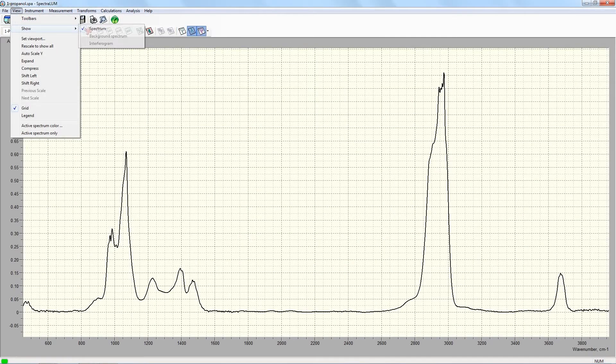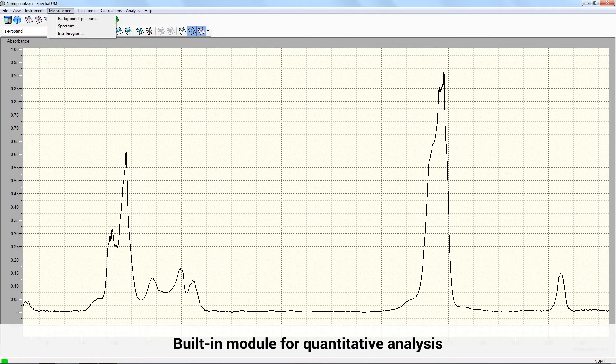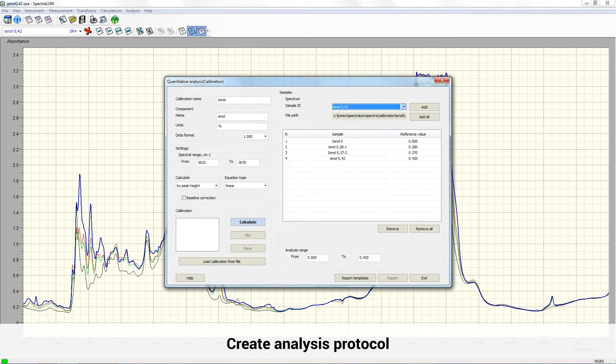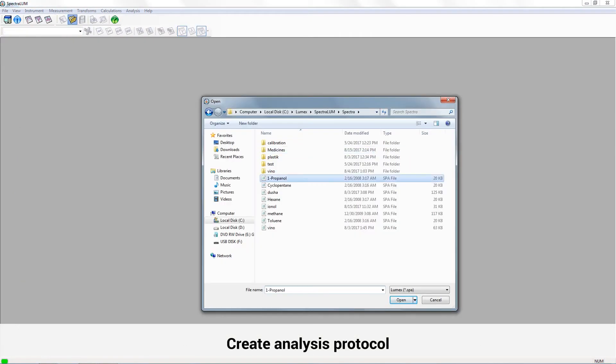The software is available in several languages. Other than performing all the basic instrument operations, it has a built-in module for quantitative analysis and automatically saves measurement results and creates analysis protocols.